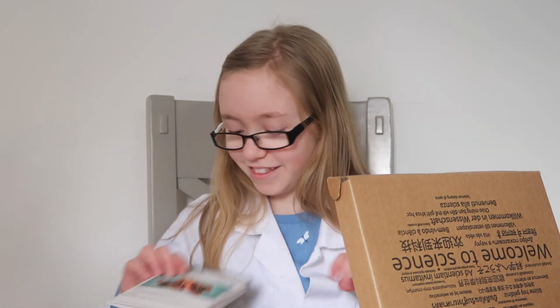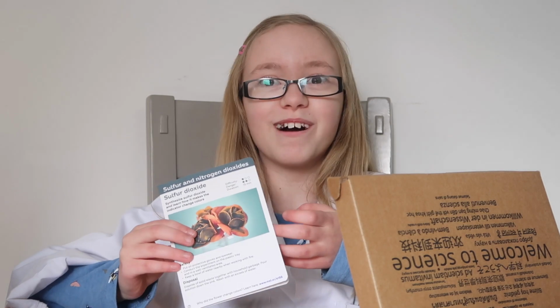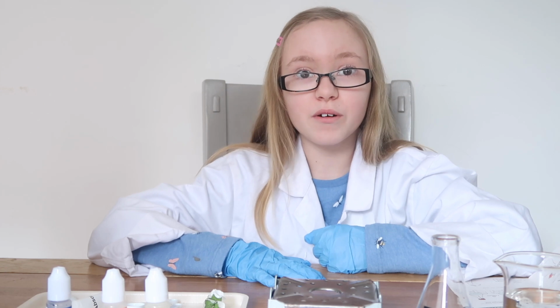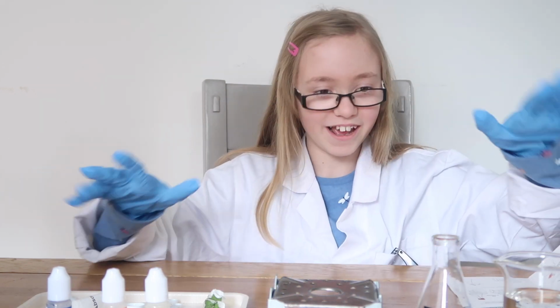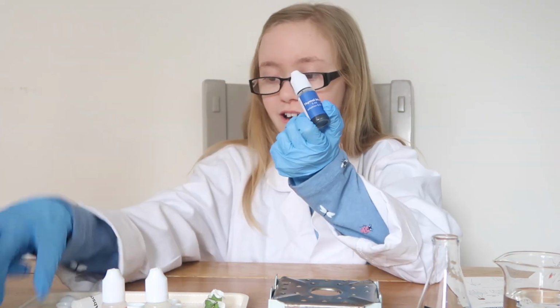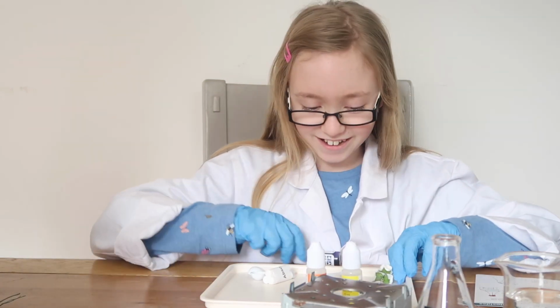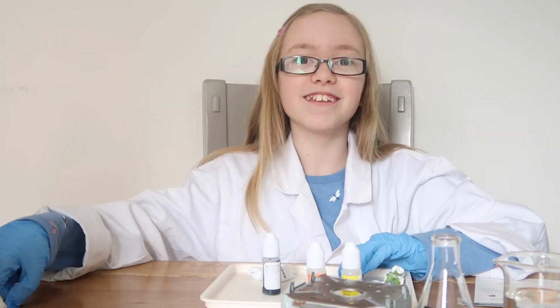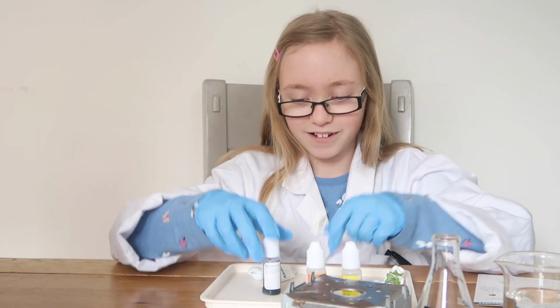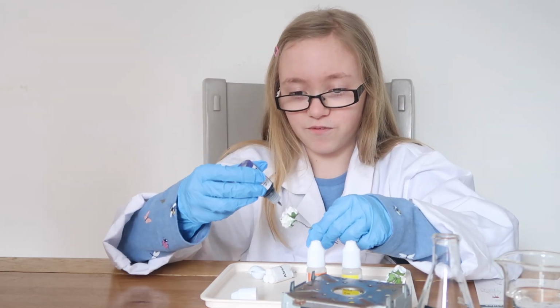So we will be doing the sulfur and nitrogen dioxide experiment. Such a mouthful. Now, let me set it up. We've got all the equipment needed here, set out nicely, and right now, the first thing we need to do is put the thymol blue onto the flower, which is why we have a tray to keep things, let's just say, halfway mess-free, because the tray will get messy, but now we've got to drip it onto the flower.